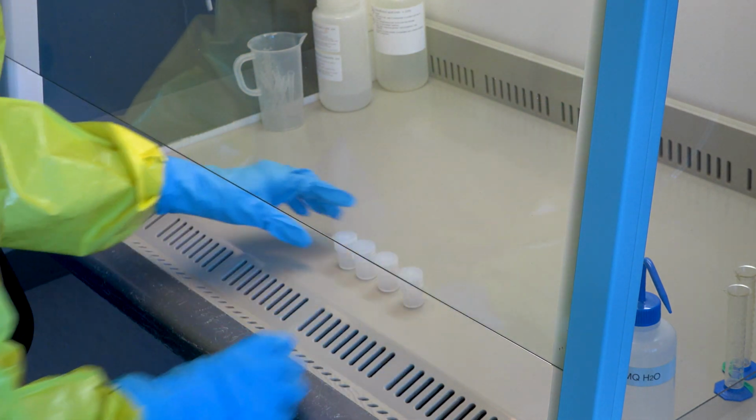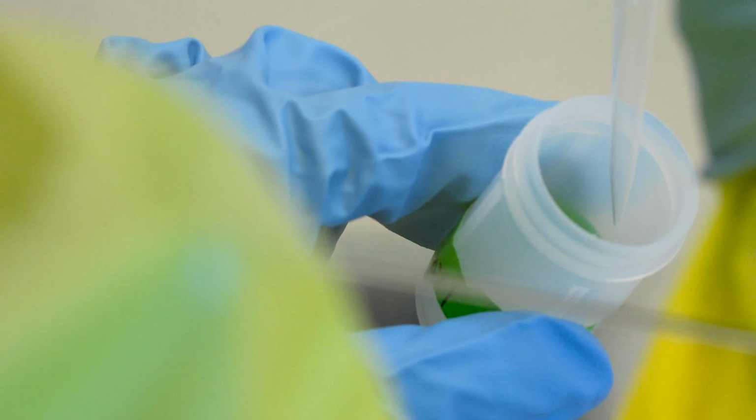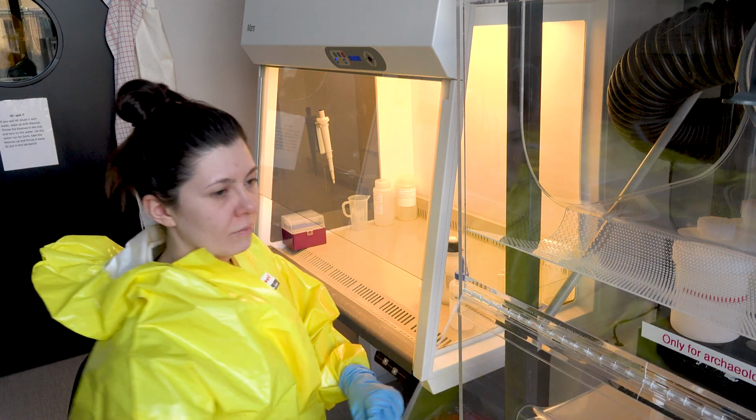When I take a sample, I focus on strontium isotopes. That's a really good tool for provenancing archaeological materials. And I separate the strontium out of this material. So whatever it is, if it is water, if it is soil, if it is plant material, I just separate it so I have strontium left, and that I analyze for its isotopic composition.